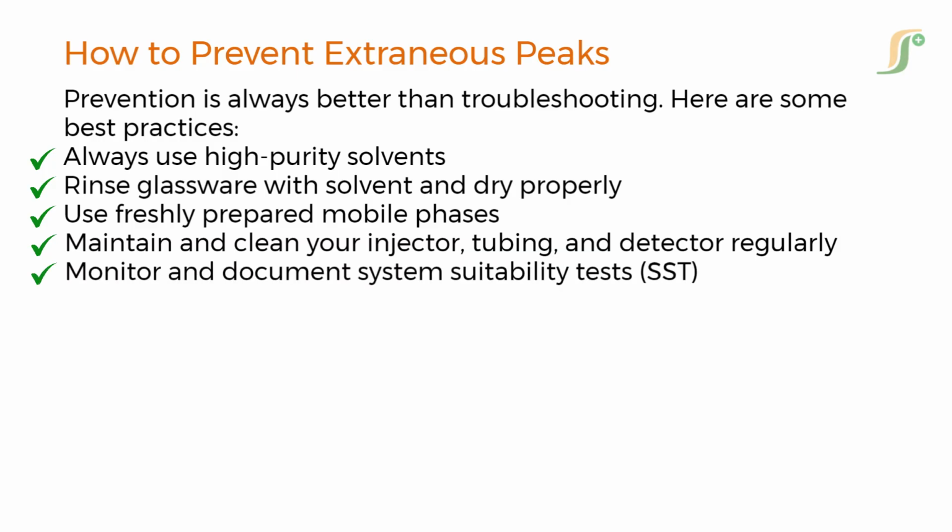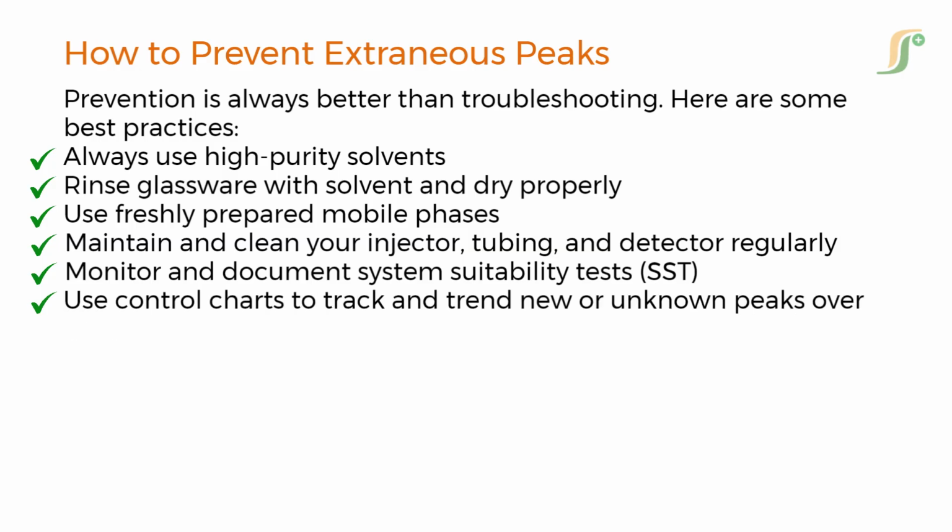Monitor and document system suitability tests, SST. Use control charts to track and trend new or unknown peaks over time. Also, ensure that your method validation includes robustness and specificity so these issues are caught early.